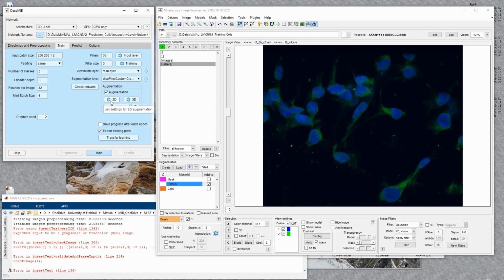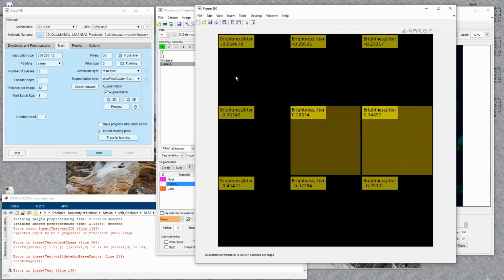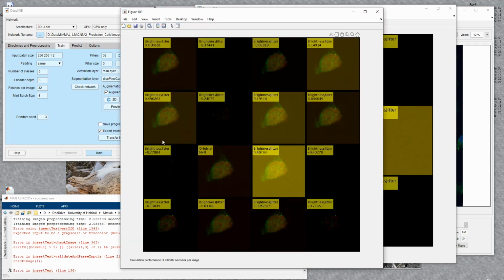And let's preview them. Okay, so now it shows the 3x3 grid, which can be changed. We can change the size of this, for example, to see more, if I put in the settings not 9 but, let's say, 16. But for now, we're just looking at an empty page. The page has no cells. What we can do is change the random seed here for picking this patch from the dataset to a different value. Now I put 3.